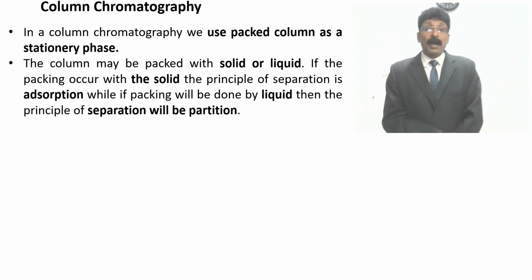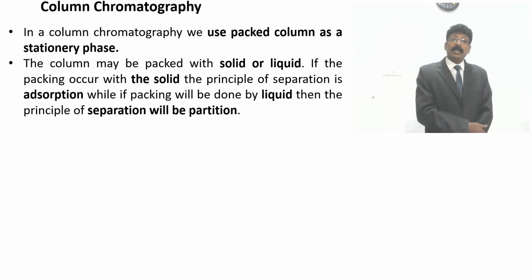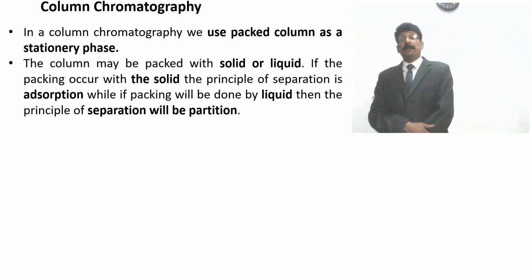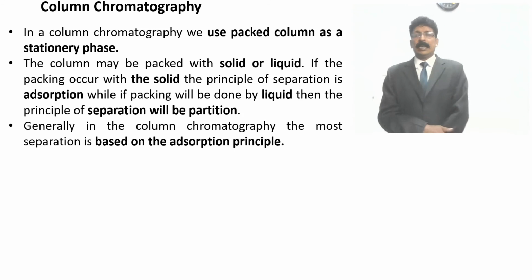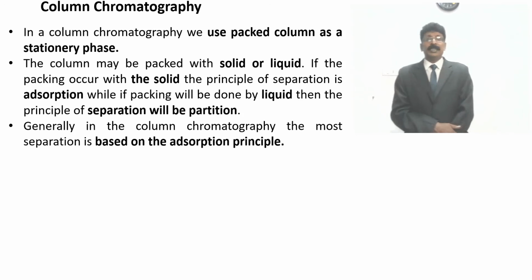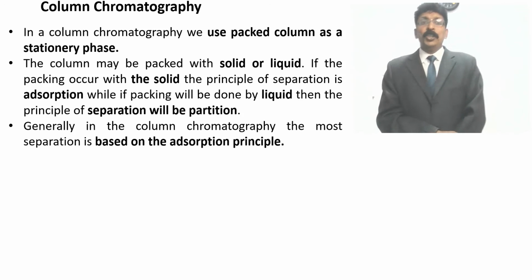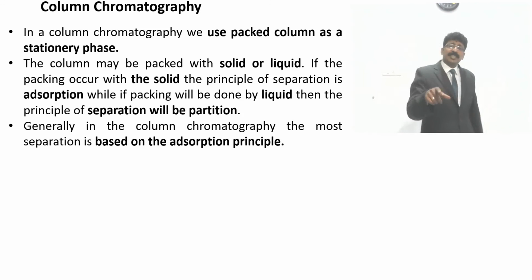If the packing is a solid, the principle of separation is adsorption, while if the packing is done by a liquid, then the principle of separation will be partition. Very simple. The student can easily write about this principle, and can also go on to the working of various techniques behind chromatography. Generally in column chromatography, most separation is based on the adsorption principle.